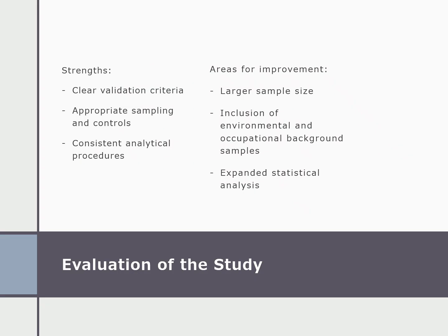The evaluation of the study. The study had several strengths, including clearly defined validation criteria and consistent analytical protocols. The methodology reflected real operational conditions used in forensic laboratories, which supports the external validity of the findings.